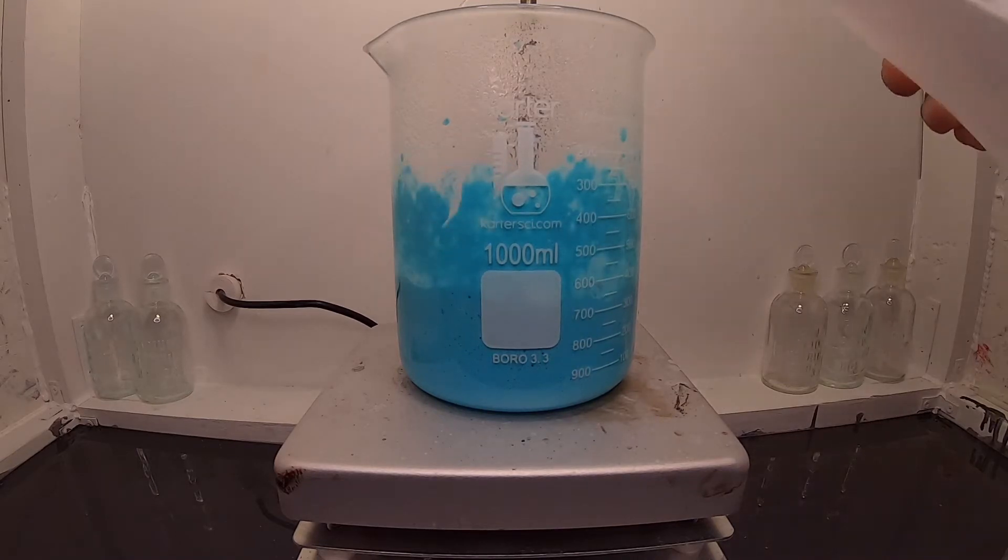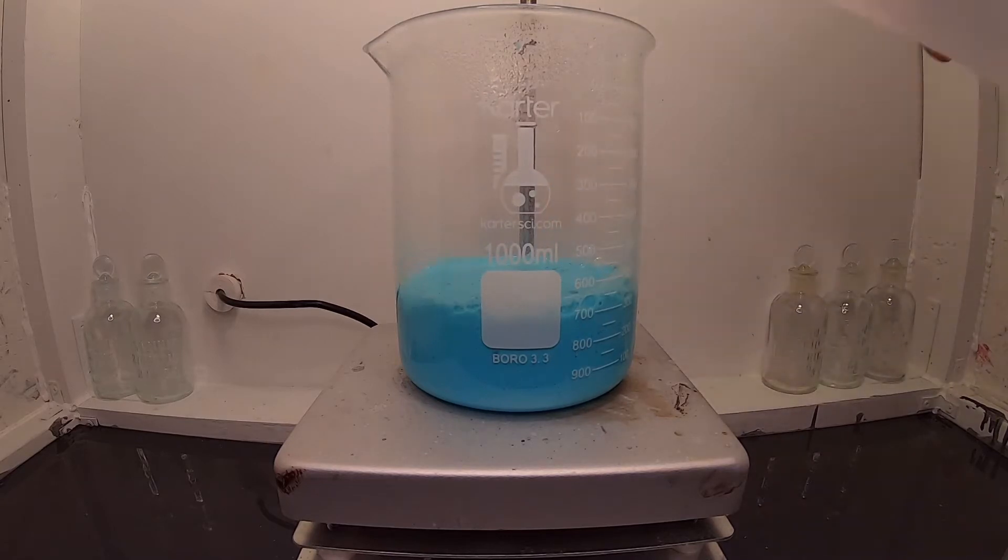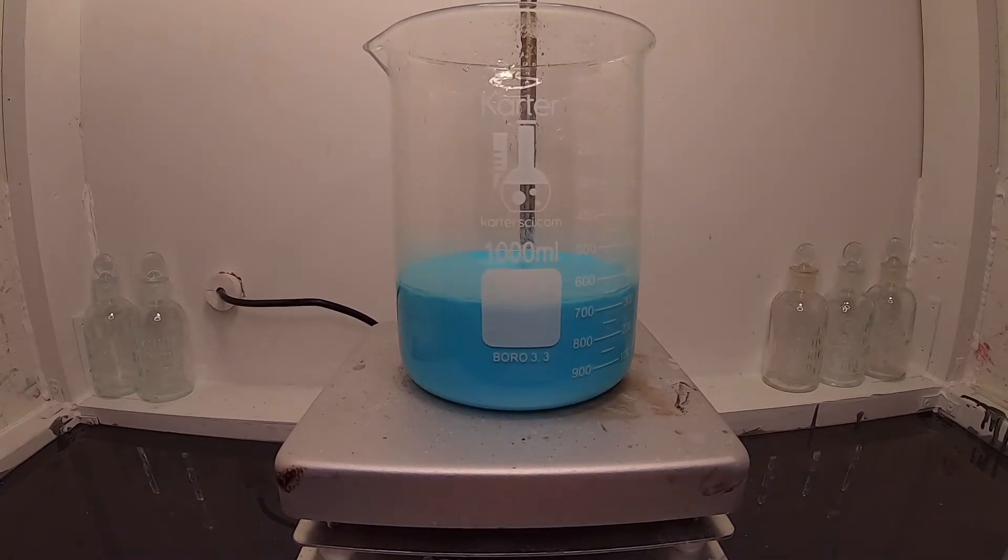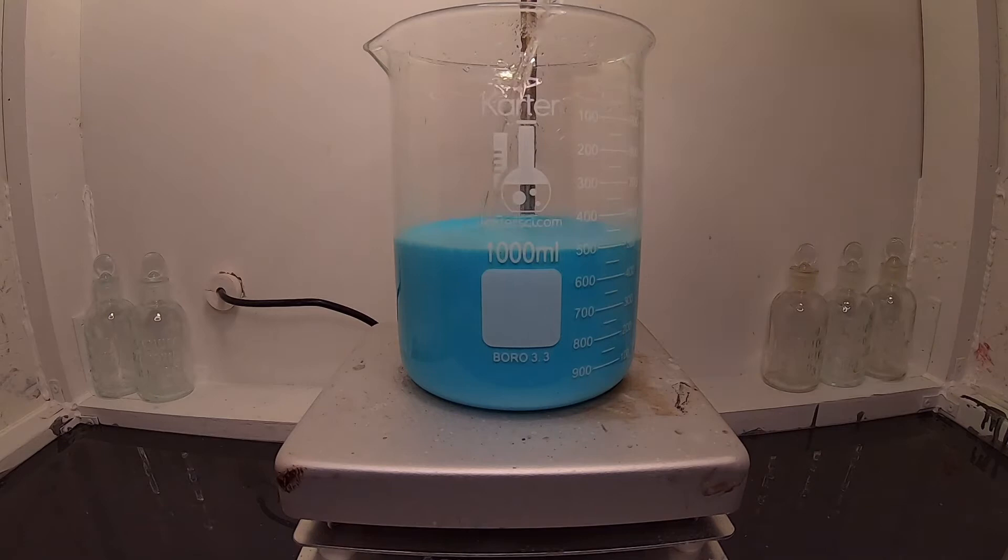The beaker is rinsed a few times to clean things up and cool it down. This is just water. Next, about 150 milliliters of extra water is added, which helps dissolve the excess sodium sulfate.